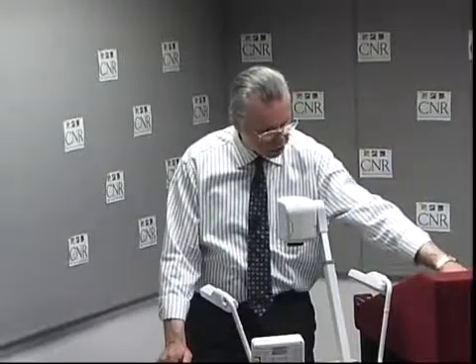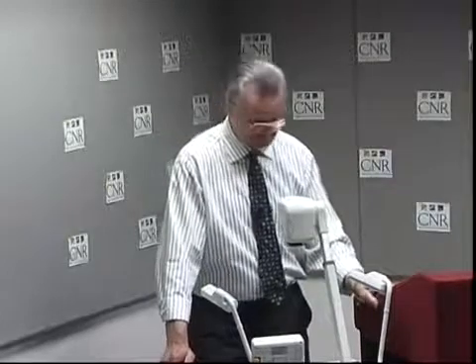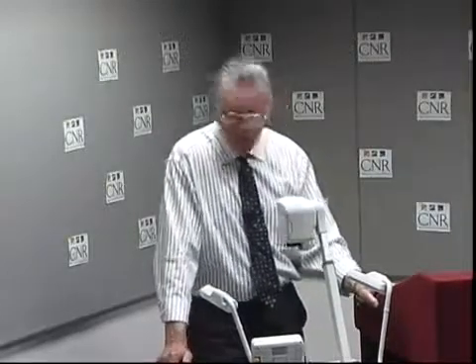Basically, 563, when it was originated, was designed for the cameras that were the only devices that had high enough resolution that were commercially available to acquire a high resolution image, but unfortunately are limited, and still are, to an area about 30 millimeters by 30 millimeters. This means that when they scan or try to quantify, they are only measuring in this very small area.